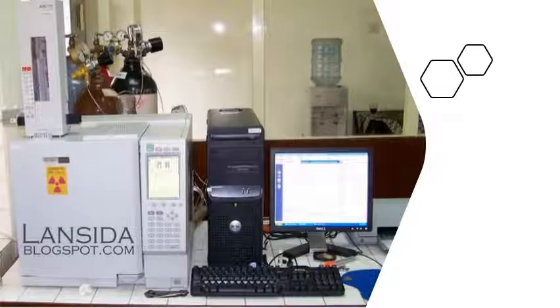So this is a picture of the gas chromatograph, in which there is the cylinder holding the carrier gas, which has the pressure controller, and this is the flow generator. We see the flow rate of the gas, and this flow meter is attached to this whole oven, in which we have a sample injection system, and the next component, the column where the separation takes place, and the detector in this oven.